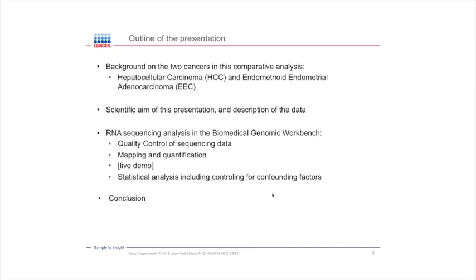And the confounding factors in this case are mainly that these studies were done completely independently of each other, so there's a very clear batch effect between them.